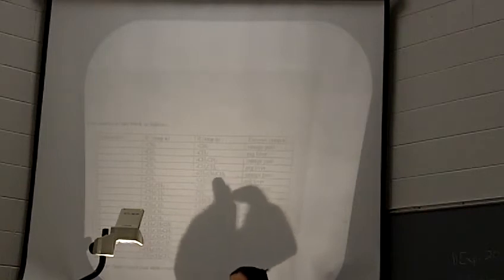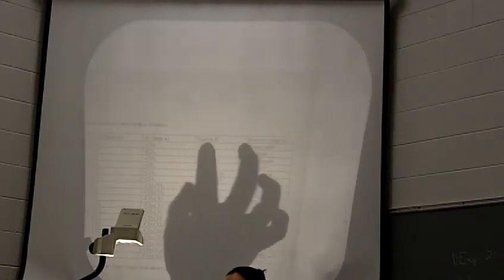With the acid chlorides, we'll talk about it next week, but you basically add on 1 carbon, okay? And then the final step, we're going to vary what enzyme you do for the hydrolysis reaction, okay? So we'll use either orange peel esterase, which will be prepared from orange peels, or pig liver esterase, which luckily we don't have to prepare, and you can actually buy the actual enzyme, okay?